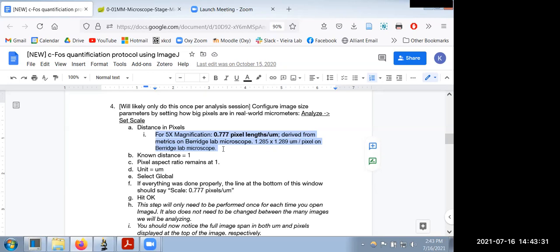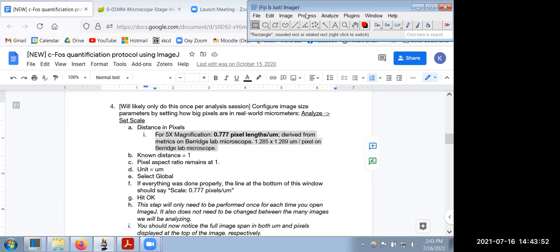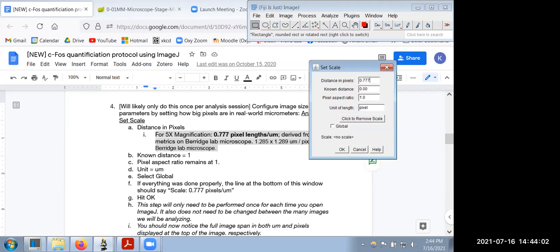A lot of these images were taken at 5x, and even at this lower magnification the staining was bright enough to quantify across whole brain sections. The number is 0.777 pixels per micrometer. We're going to go ahead and program that into ImageJ by going to Analyze > Set Scale. We put in 0.777 for the pixel distance, set the known distance to 1 for micrometer, change the unit to UM, and keep the pixel aspect ratio at 1 to keep things simple.